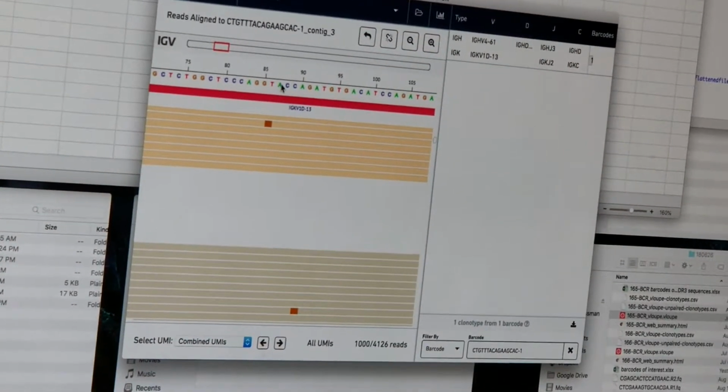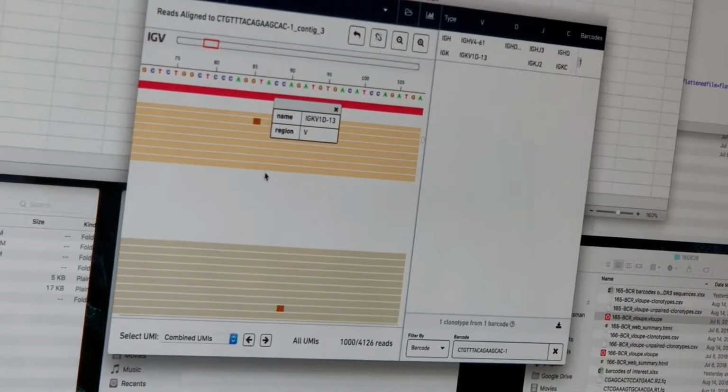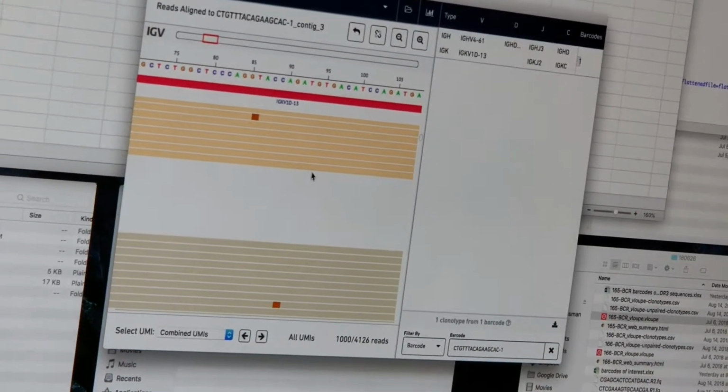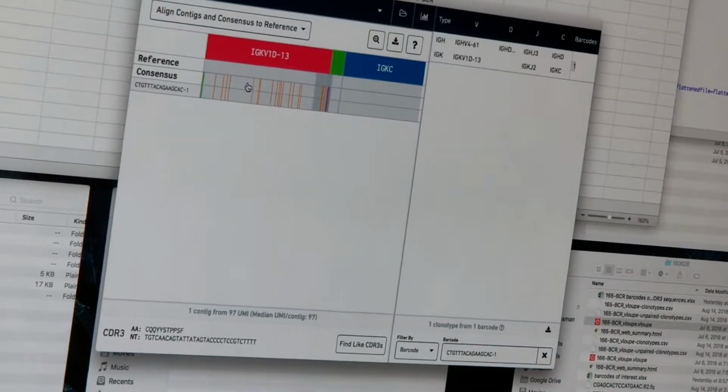I mean, there are mutations. You showed it in your overview. Right. How did it determine those are real mutations? If you go back to the big view. Yeah, if I go back to this view, how does it know those are, probably that it's got a.